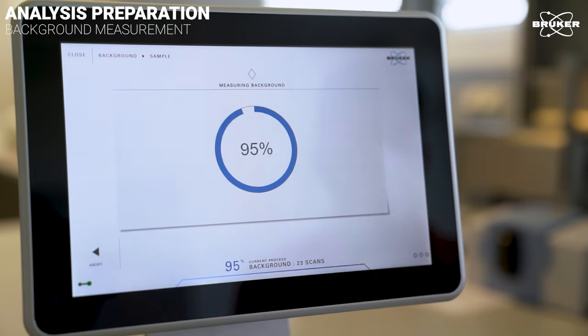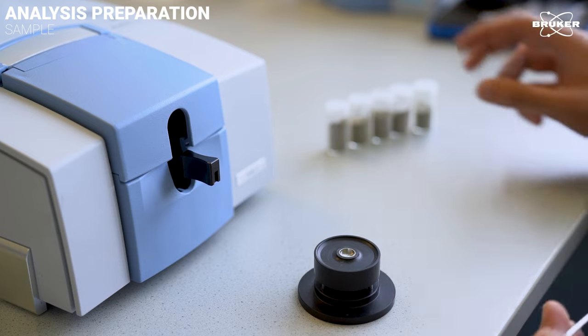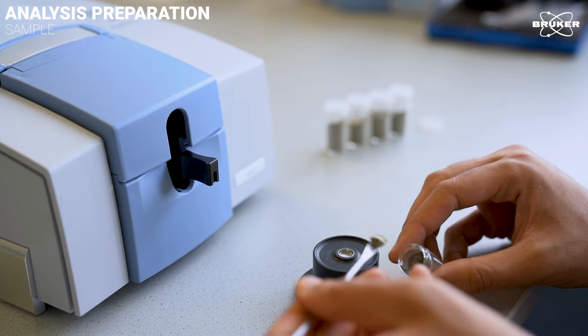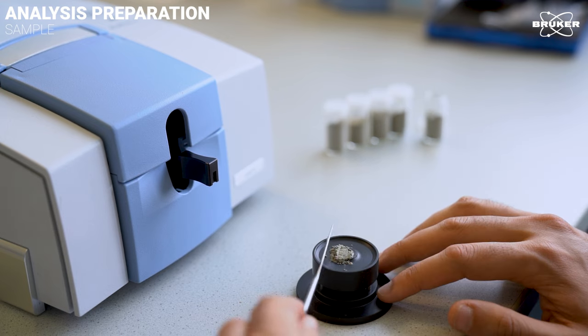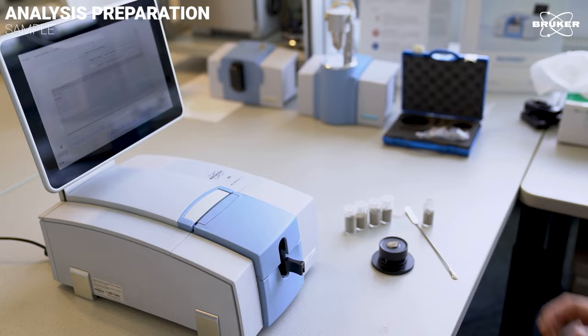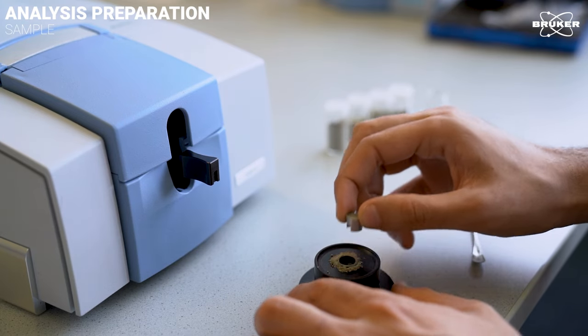The background has finished and we can prepare the cement sample with the help of a sample guide and a spatula. The sample is carefully distributed within the sample cup without using pressure. The sample guide is then rotated downwards and the sample cup removed to be placed on the DRIFTS module.